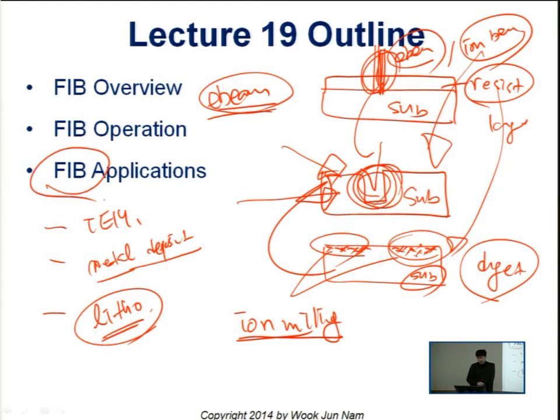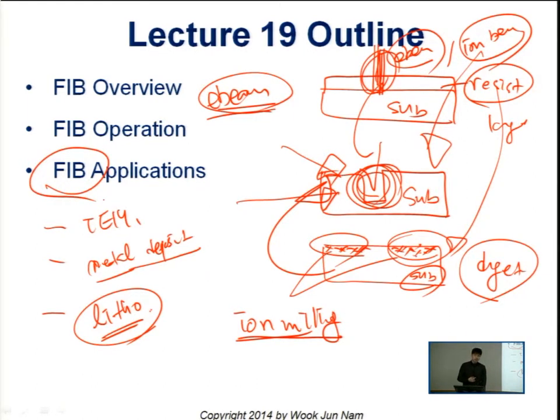So focused ion beam offers very many options. This tool is the most versatile option it can offer, especially for nanotechnology.